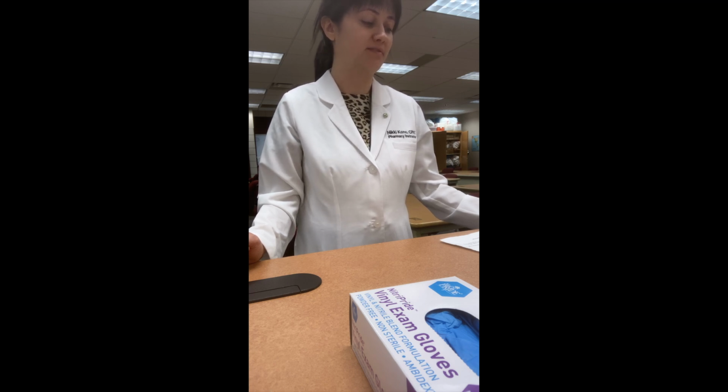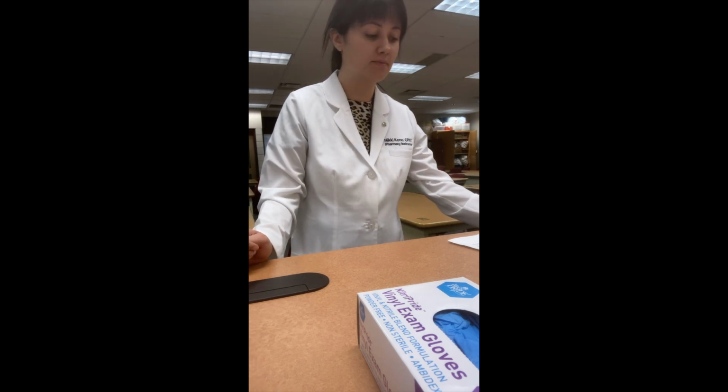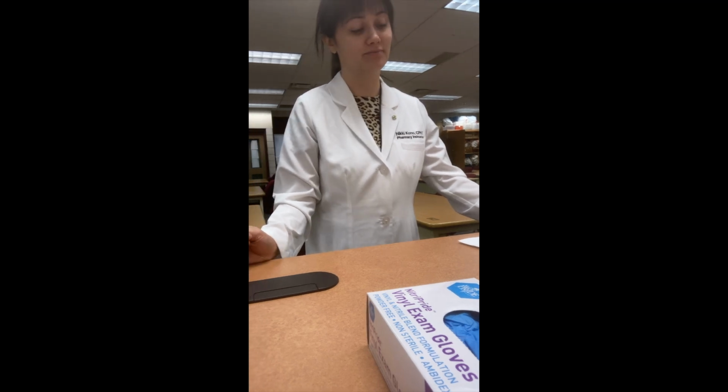We will practice the following skills: locating information on a stock container, gathering information for a compounding record, measuring liquids and solids, overall safety, calculating percent error, determining beyond use dates, translating SIG codes, filtration, spatulation, and cleaning.